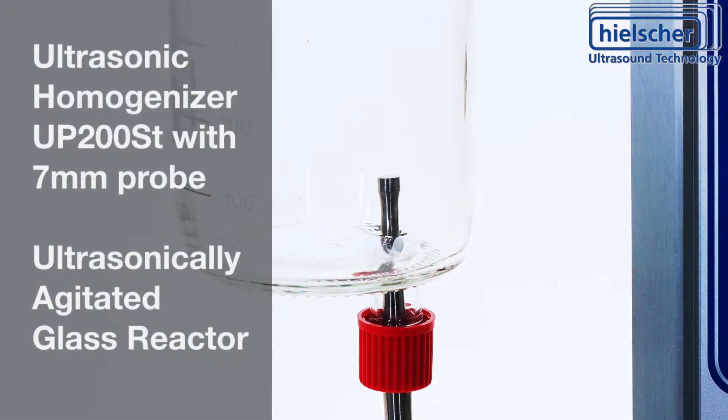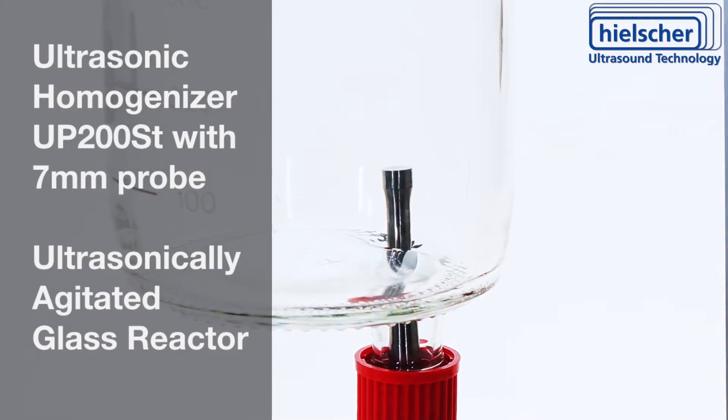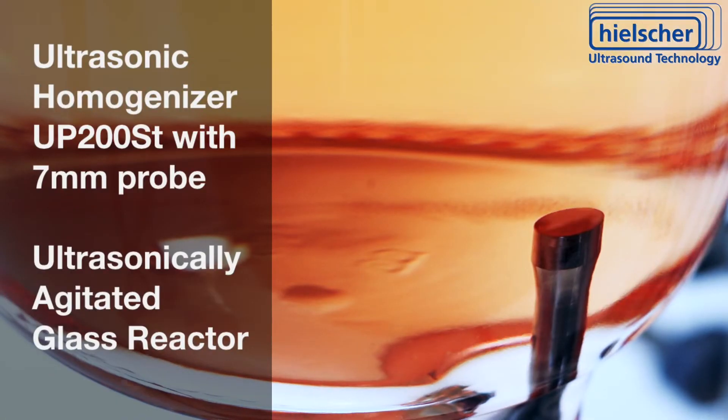Hielscher Ultrasonics makes ultrasonic sonotrodes for easy integration into stirred batch reactors. The ultrasonication can increase chemical reaction rates, initiate catalysis, homogenize, improve dissolving, extract compounds, or reduce emulsion particle size. The ultrasonic energy can also remove gas bubbles or dissolved gas from the liquid.